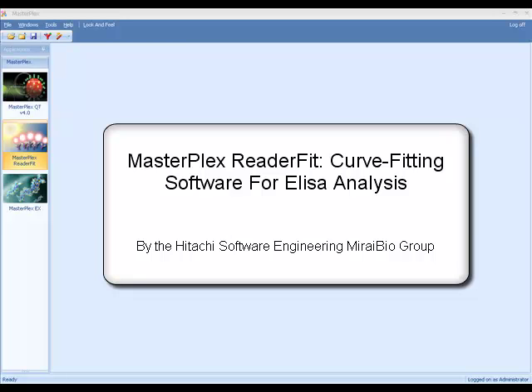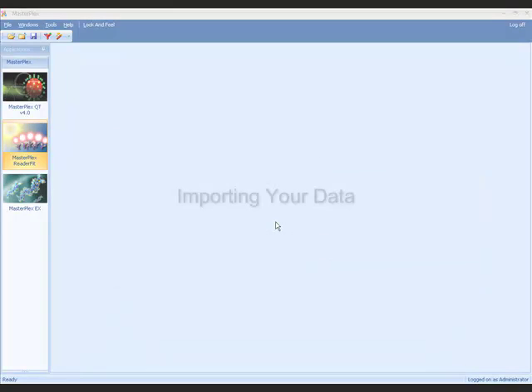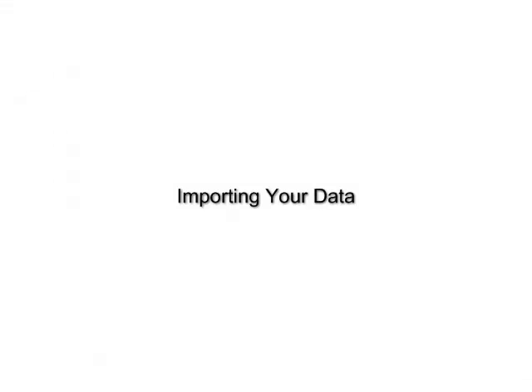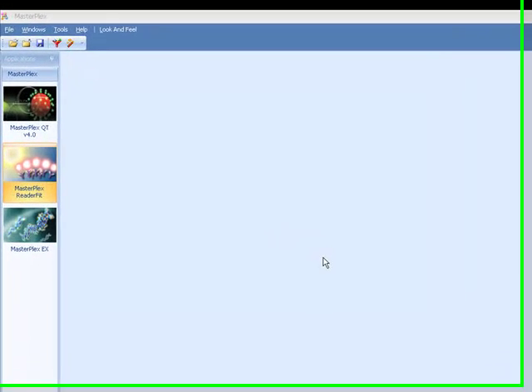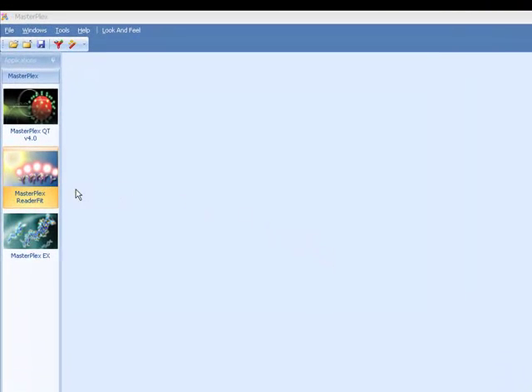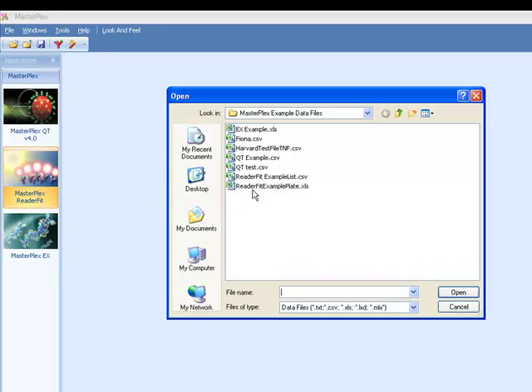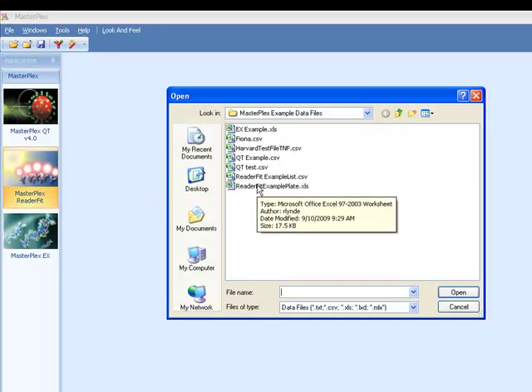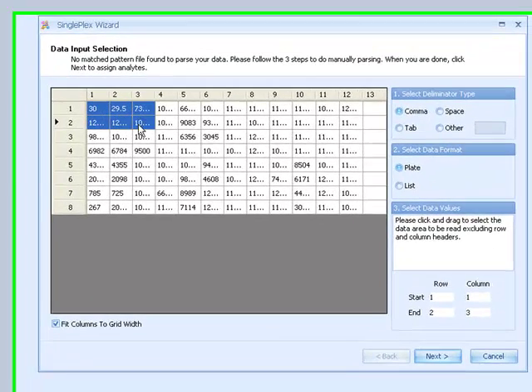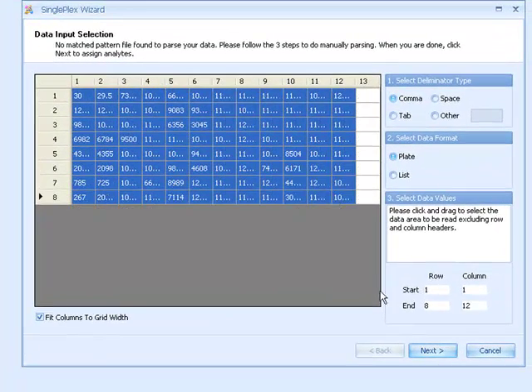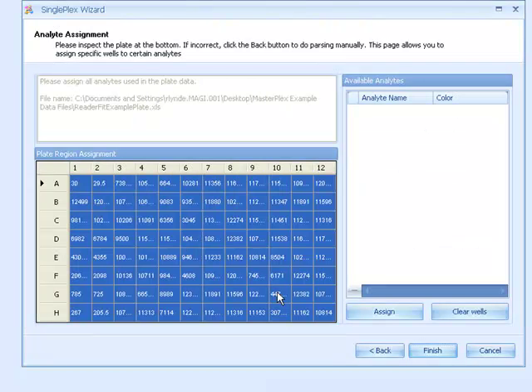MasterPlex ReaderFit, curve fitting software for ELISA analysis. MasterPlex uses a flexible file import wizard to allow easy importing of data in most formats. Browse to your raw data file and select the raw data. Assign and name your analyte here.